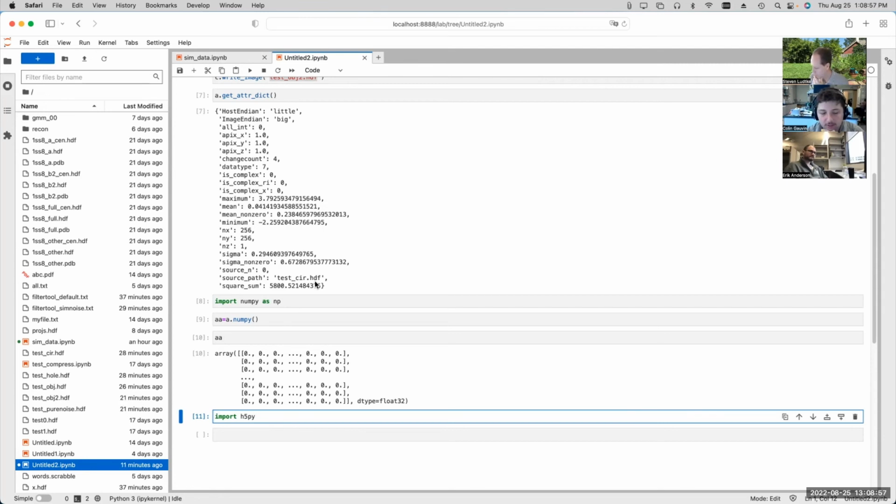Yeah, so unless you're going to do particle polishing in Relion or something like that, where it wants the raw movie stack per particle. But at some point, you still have to get to having that averaged movie, right? I mean, that micrograph. And the way that's being stored right now, it's like 10 times bigger than it ought to be. So people always have those floating around in their file system. Very often, they're almost as big as the original raw TIFF movies.